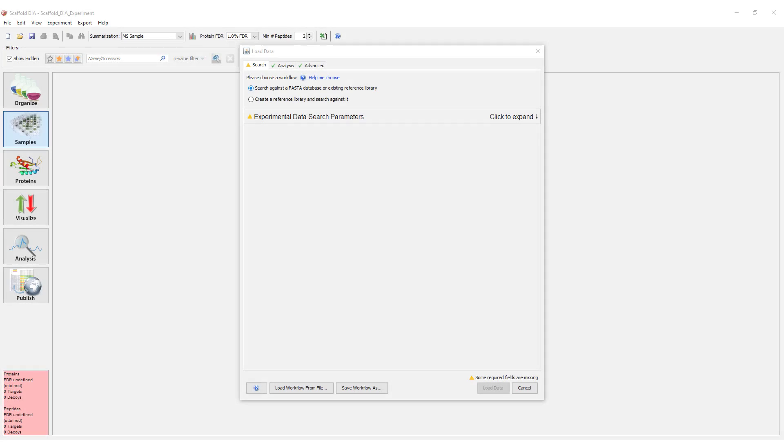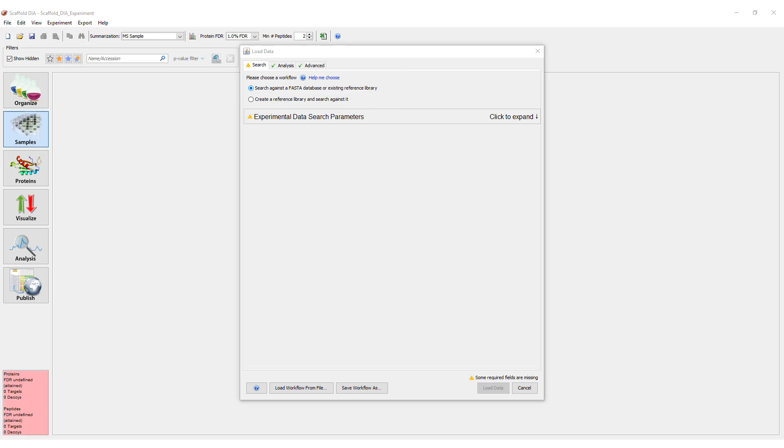Scaffold DIA contains two workflows for analyzing files depending on what data you have available. Option 1 simply allows you to search experimental data against an existing library. This library can be a FASTA file, a Blib file, or an ELib file.